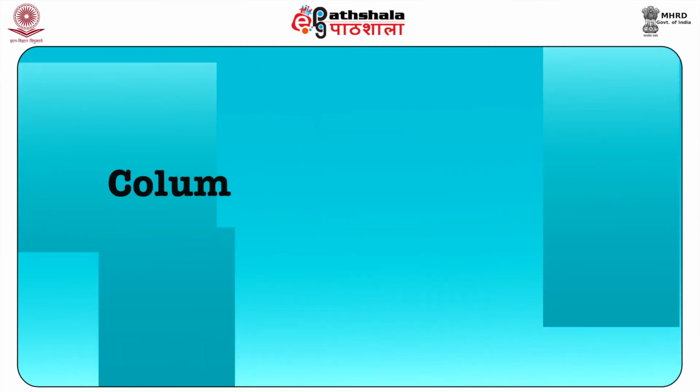The next method we are going to study is column chromatography. Now, if column chromatography utilizes the property of size, it is called gel chromatography. The other physical property which is utilized is the charge. In that case, it is called ion exchange chromatography. Affinity chromatography, on the other hand, can be used if any inhibitor for the enzyme of interest is known.